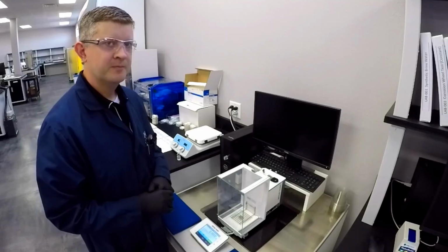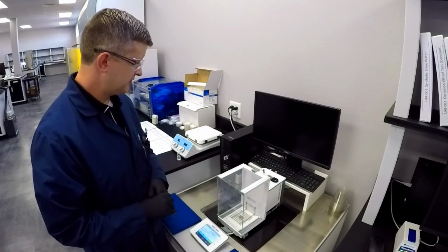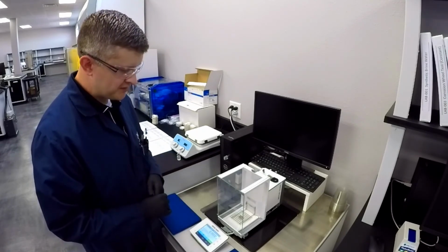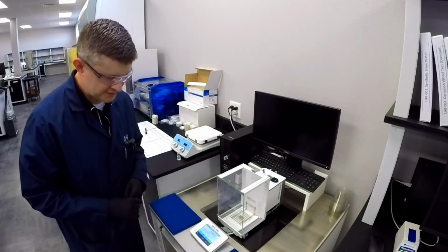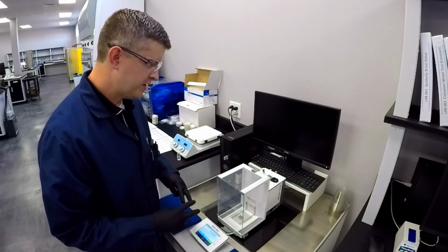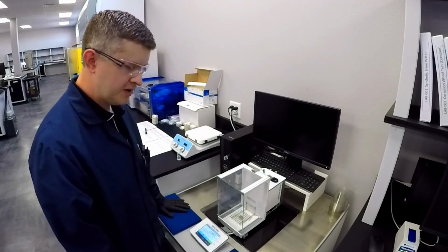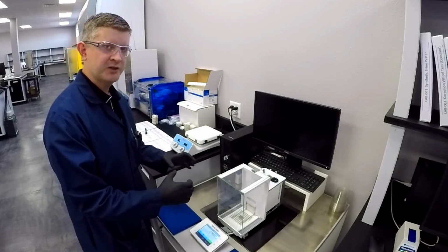It's a pretty fancy looking table. Can you tell me a little bit about that? Yeah, so this is a balance table that Mettler Toledo makes, and it's about 300 pounds. It's 2 pieces, so this part of the table is going to be independent of the actual balance.